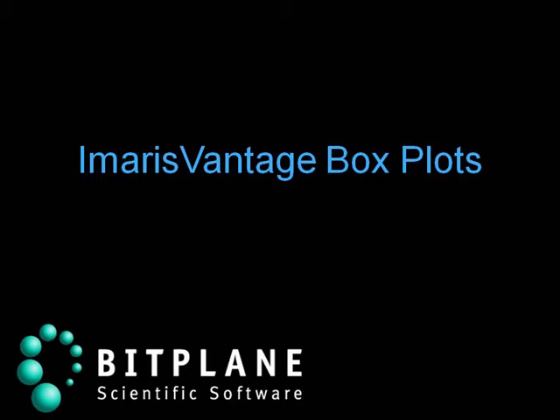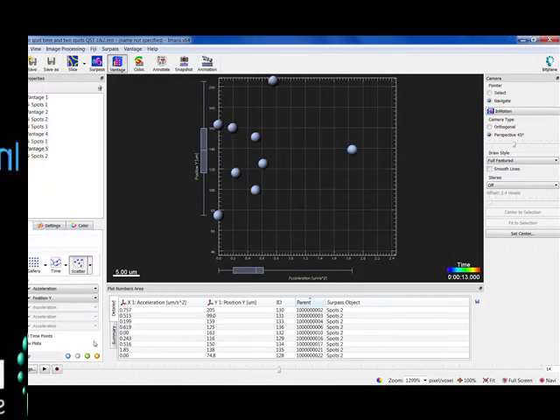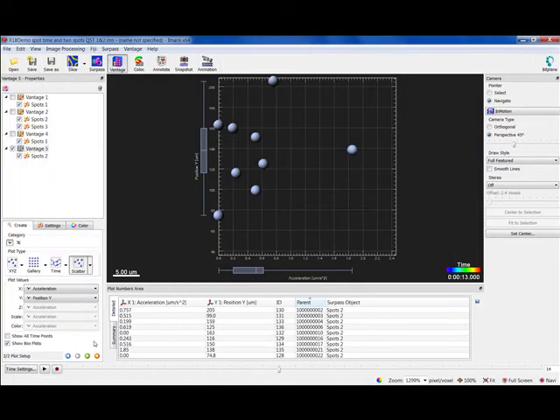This tutorial describes box plots within ImarisVantage. It will show you how to interpret the concise box plot information and how box plots can help you discover more about your data.